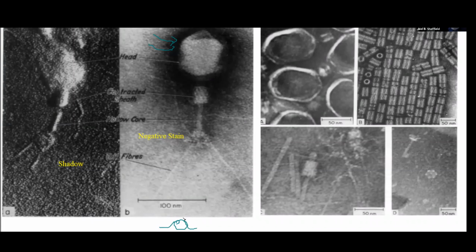Okay. On the other hand, the stain is easily able to enter portions of the structure of this sheath, which is supposed to be the thing that actually squirts the DNA into the bacterium. Okay. And to show you quite a bit of detail of the hollow core and even these attachment fibers.